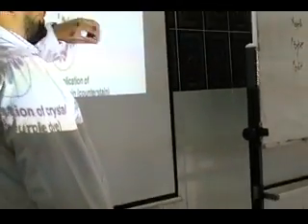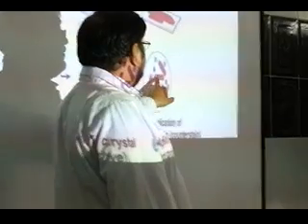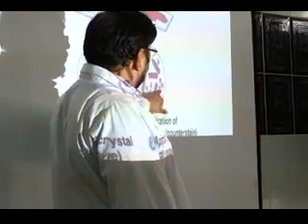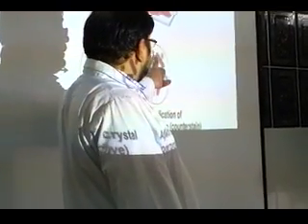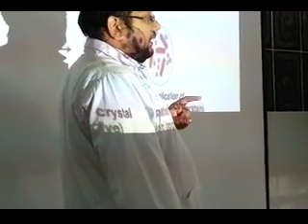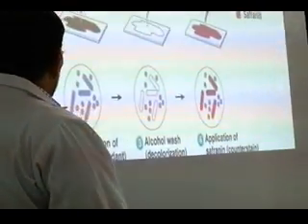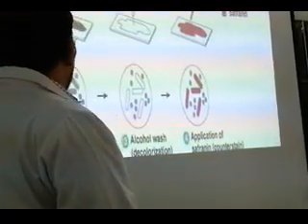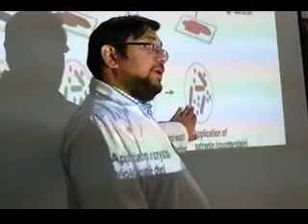The next step is safranin. There is slight confusion in safranin. Some say 30 seconds, some say 2 minutes, but we use both. You can use 30 seconds. You put safranin in for 30 seconds. What will happen? Only the bacteria that were colorless will become red and pink. When these become red and pink, this shows you two types of bacteria. The purple or violet or blue-black color are gram-positive and the red are gram-negative. If you start from here and there were only gram-positive, they will become purple. If there was only gram-negative, they will appear only red.